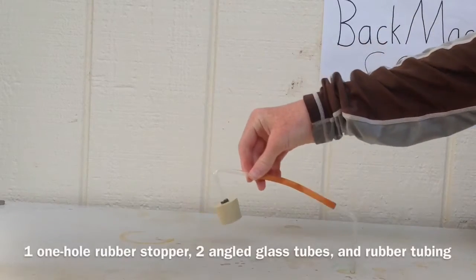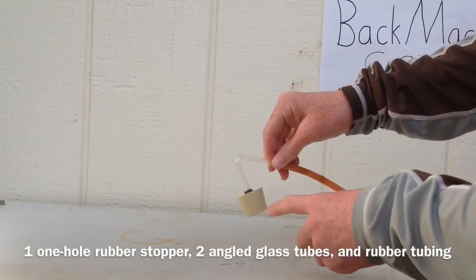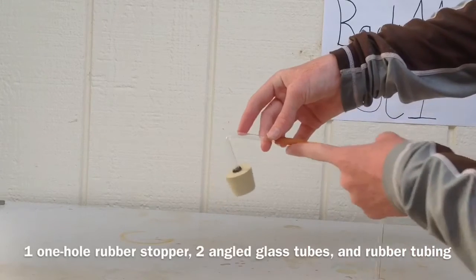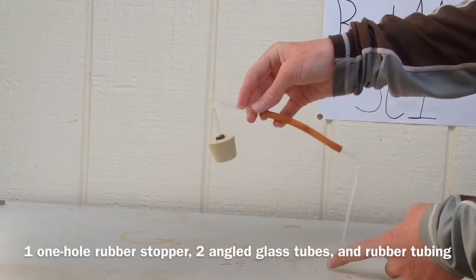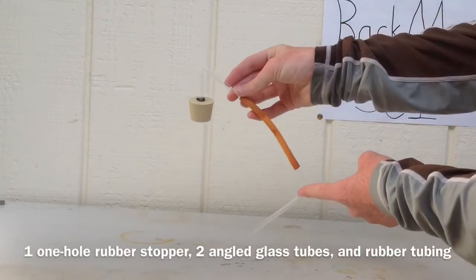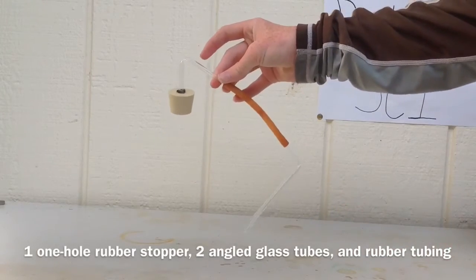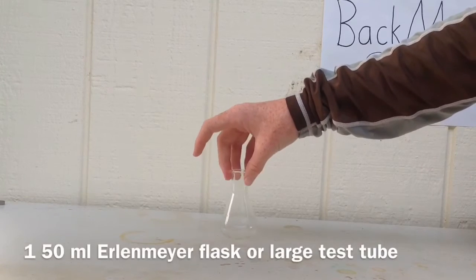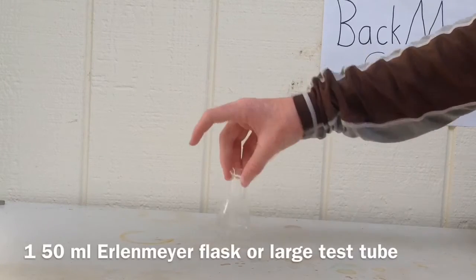You will also need this setup: a rubber stopper for the flask, an angled glass tube, a piece of rubber tubing, and a 90 degree piece of glass tubing to go into the mini flask. This mini flask will be collecting the nitric acid and will be holding the hydrogen peroxide.